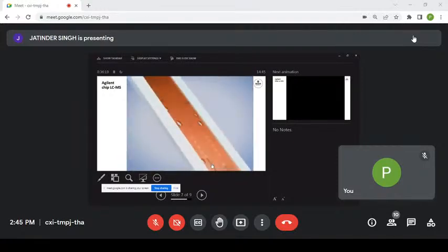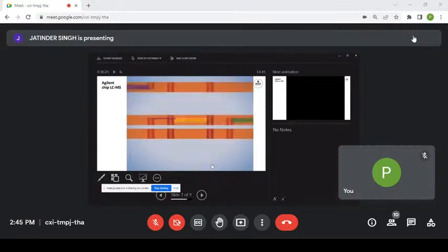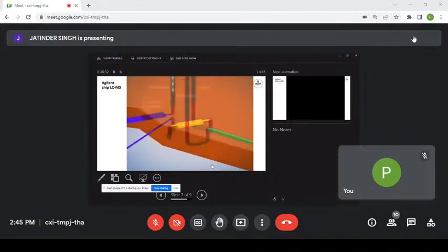So this is a product, I think it's been on the market for 15 years or so. So that's the way that the fluidic pathways are being formed. So that's partially microfabricated, partially not. There we go. It's the liquid pathway pump, first dimension.